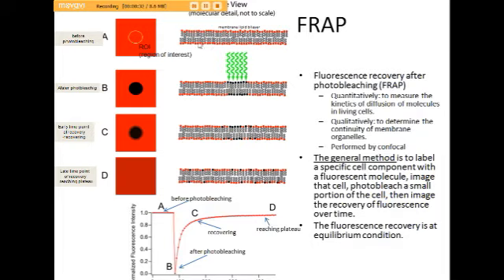Now let's use an example to show you how this works. Imagine we have a membrane lipid bilayer, a 2-dimensional surface. This is the membrane lipid bilayer. This is one leaflet, this is another leaflet, this is the side view, and this is the in-plane view from the top view. These lipids are labeled with a red fluorescence. It's homogeneous because lipids can diffuse freely within their leaflet 2-dimensionally.